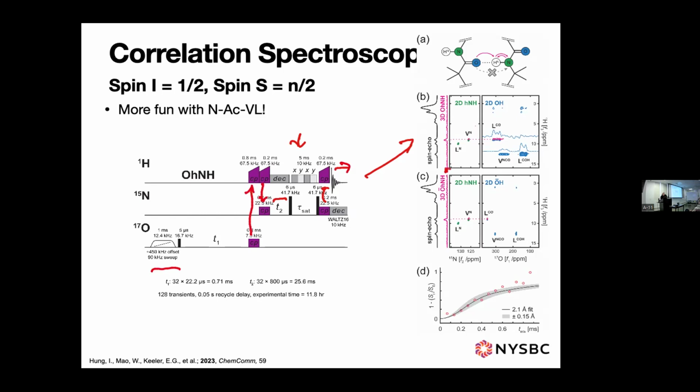In a 1D, the spin echo just looks like this. This is not spinning particularly fast. We're spinning at 16 kilohertz or so, I believe. Well, maybe not. No, it looks like it's spinning at 60. This is 60 kilohertz, sorry. It just looked very broad, but it is because it's an amino acid that has pretty strong coupling.